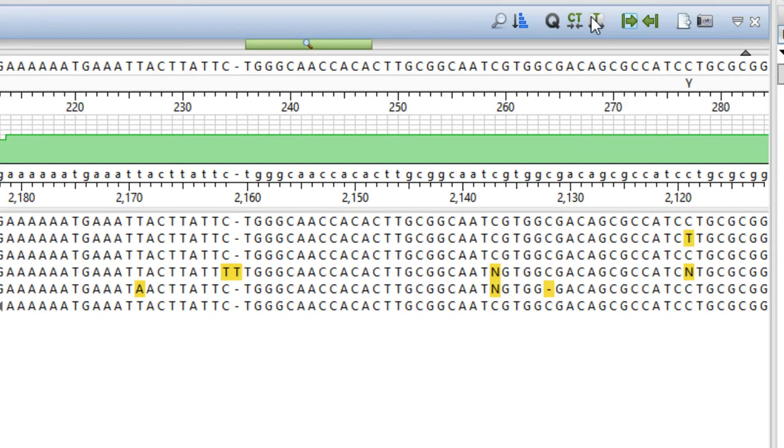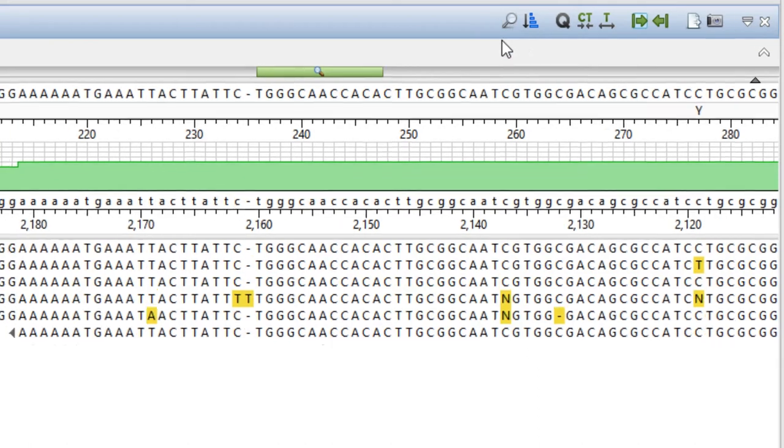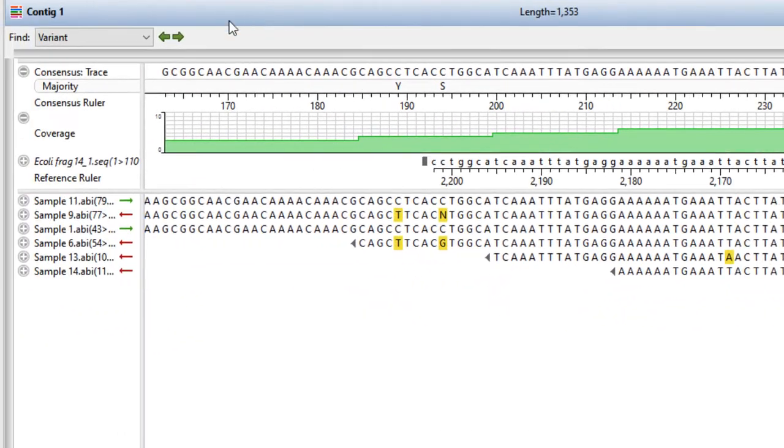To search in the alignment view, first open the search bar by pressing the magnifying glass icon. Then use the drop down menu and the green arrows to the right of the menu to perform the search.